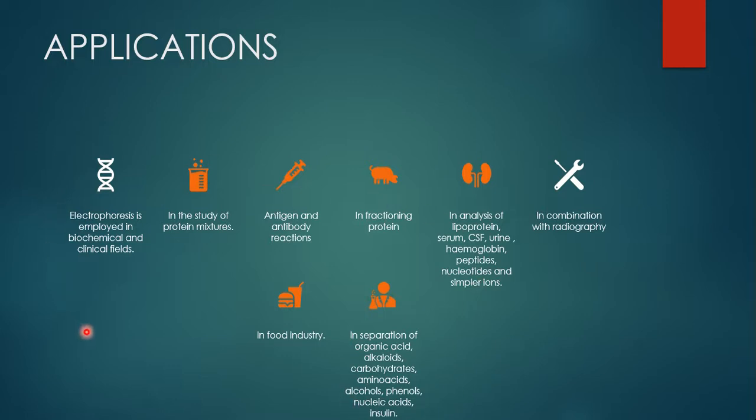So these are a few applications of electrophoresis: in biochemical and clinical fields, protein mixtures, antigen-antibody reactions, protein fractionation, analysis of biochemical samples, combination with radiography, the food industry, and in the chemical field for separating both organic chemicals and biochemicals. So this is all about the applications of electrophoresis.